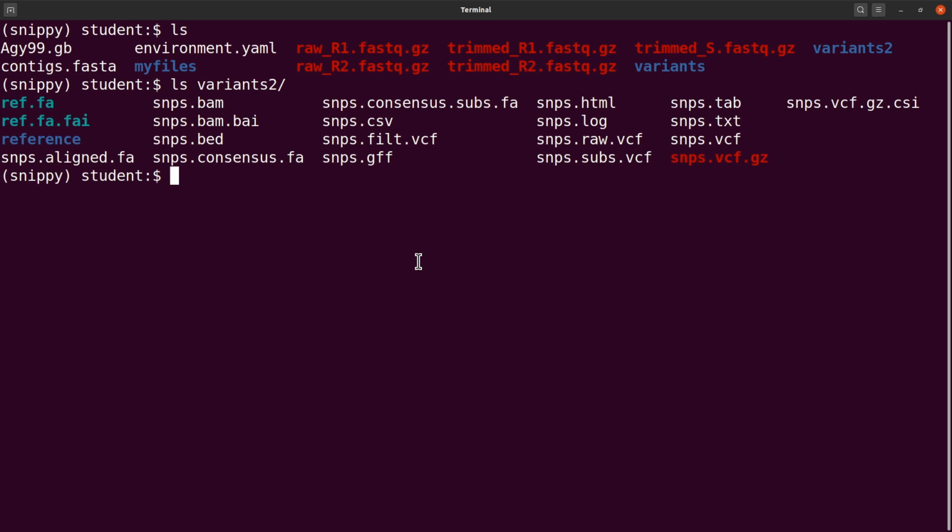With programming in general too, it's helpful to automate these things. If you have multiple samples, then that's all the more reason to write your bash script, and have your Python or R code to help you process these things quickly. So this is how it is.